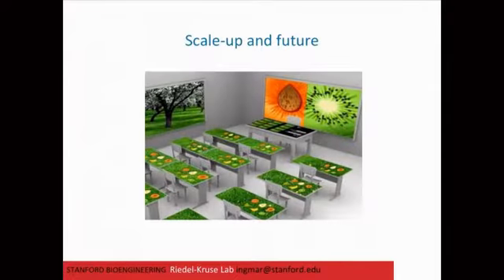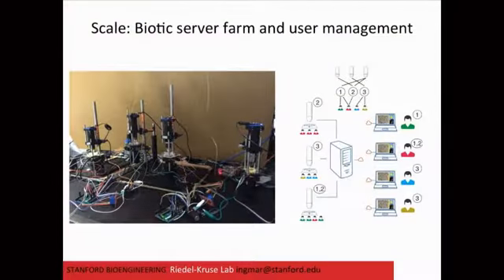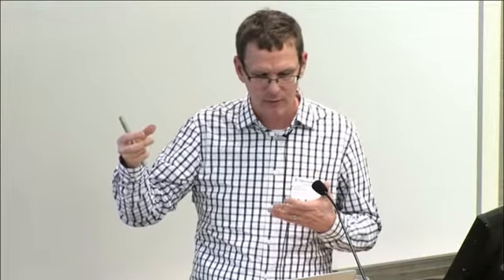So what's the long-term vision? How would that scale in the future? What you see here is multiple of these microscope setups. The image is not very good, but essentially it's a camera here, the objective here, and then this little chamber. You may also see the tubes where we have the organisms in larger culture chambers, and from time to time we flush fresh organisms into these chambers, giving systems that can run semi-autonomously over multiple weeks.